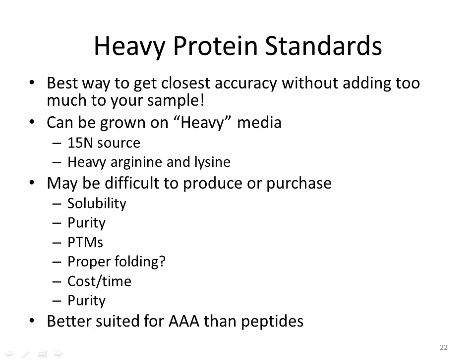Proteins, however, going back to amino acid analysis, I think they're better suited for amino acid analysis because when you hydrolyze a protein, you get many of each amino acid because you've got very large proteins. With peptides, you might get 1 or 2 of a particular amino acid, and that's just not giving you as good quality data. With proteins, I think overall you tend to get closer concentrations of your stocks when you do this procedure.